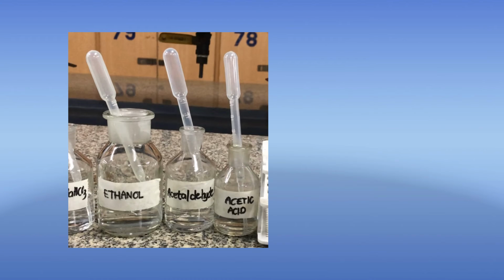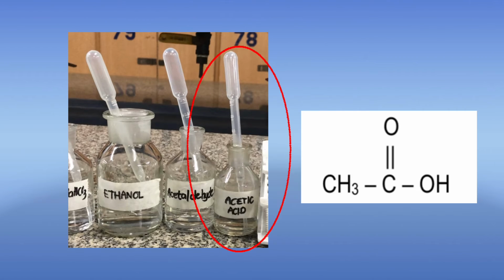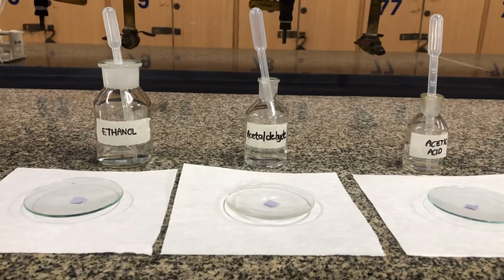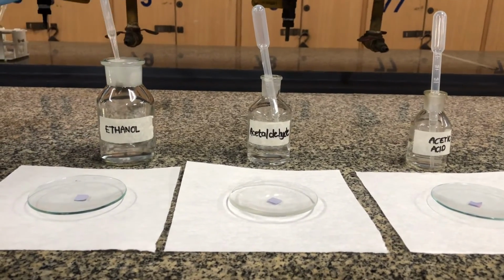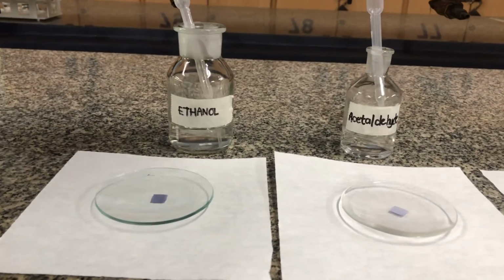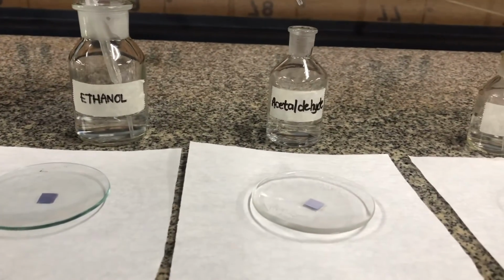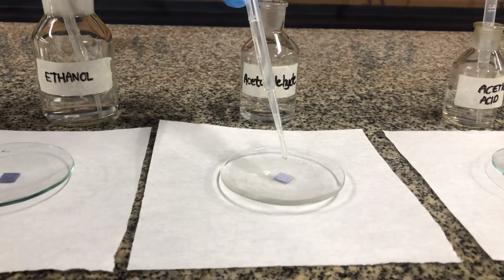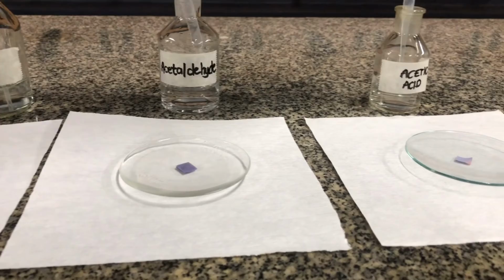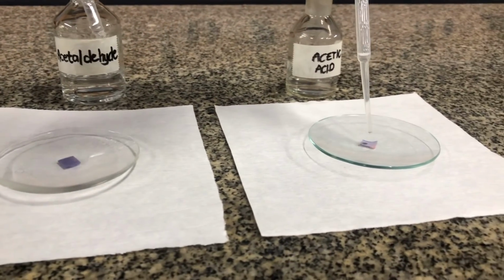The representative carboxylic acid used in the experiment is acetic acid. Ethanol and acetaldehyde were also used for comparison. As mentioned, the test is very simple. Add a drop of ethanol, acetaldehyde, and acetic acid onto prepared blue litmus paper in a watch glass. The turning of blue litmus paper to red is an indication that the substance contains an acidic group. Such observation is seen in acetic acid.